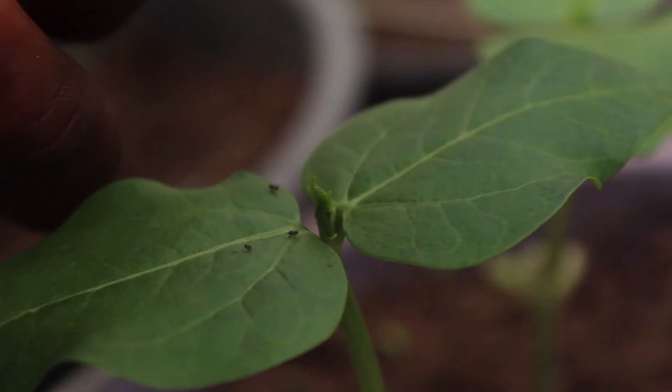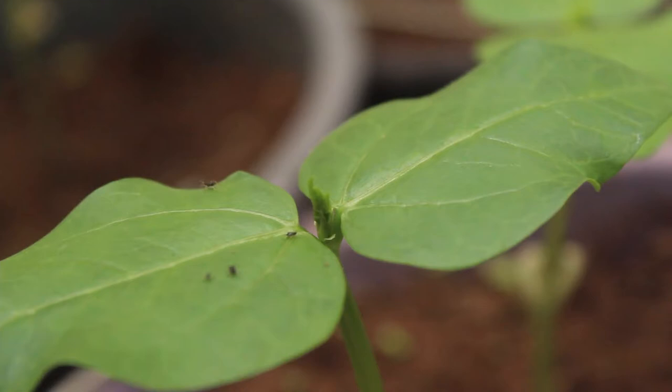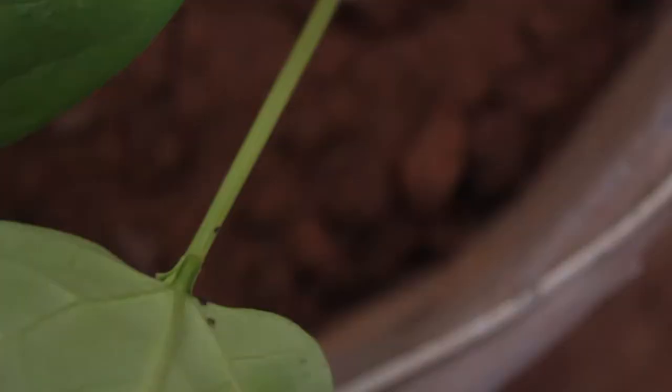A brush is used to pick the aphids and gently place them on the leaves. These aphids often move and hide under the leaves where they start feeding on the seedlings and multiply.